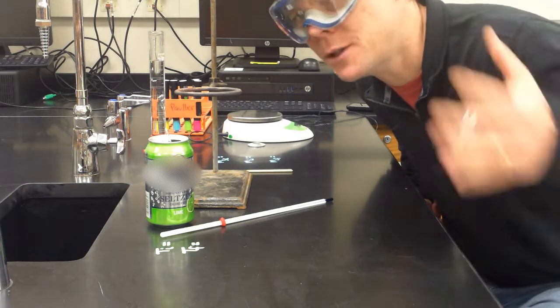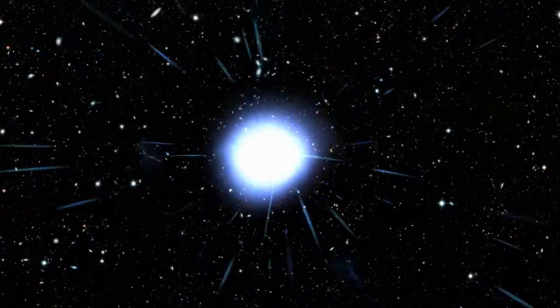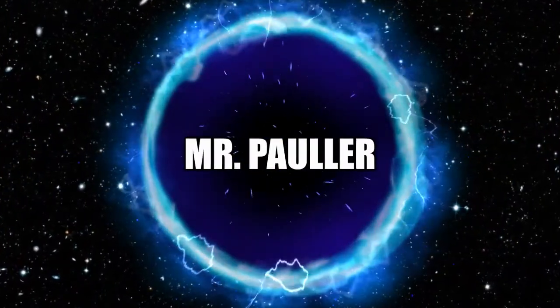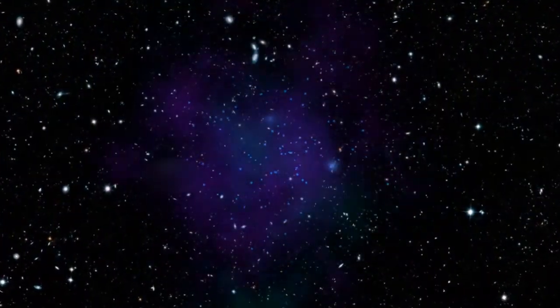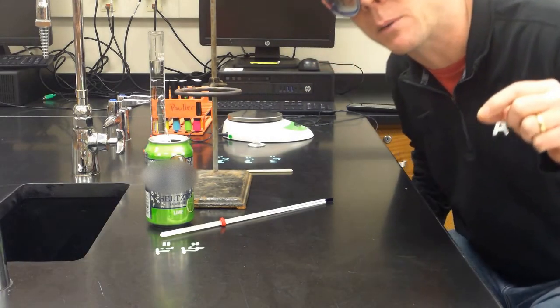In this video I'm going to show you how to do an experiment to determine the caloric content of wax. Let's take a look at the materials we're going to use in order to do this experiment.